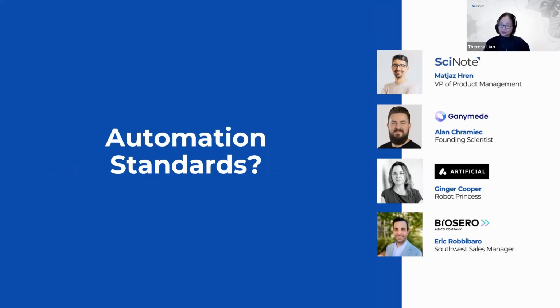Now, for things to talk to each other, it's almost necessary to have some sort of standard, like a common language, so that equipment can talk to a platform, or to software, or some kind of downstream software. So here's a question for you, Matjaž, to start. What kind of standards exist in the automation industry, or the lack of standards, perhaps I should say, and what is the current situation? What are we looking at when it comes to how that impacts labs who are looking at automation solutions?